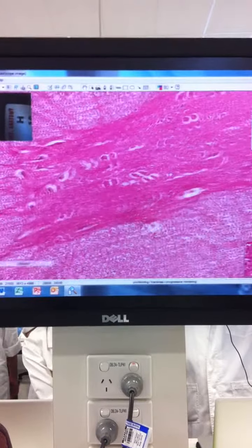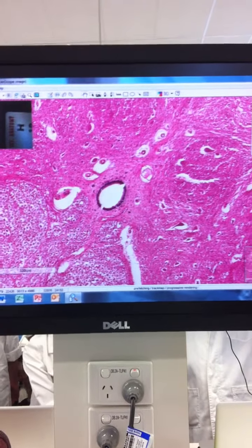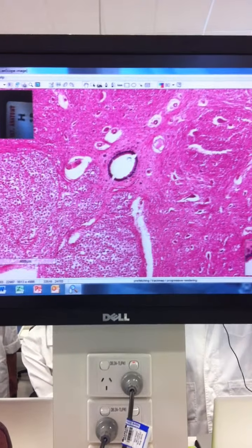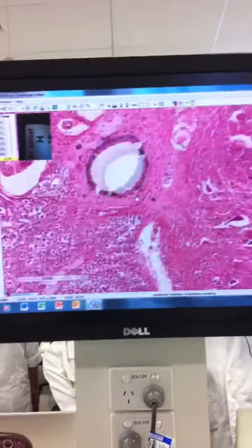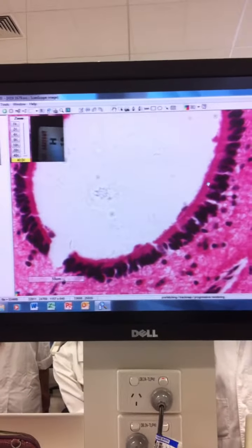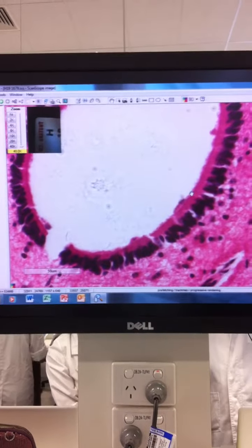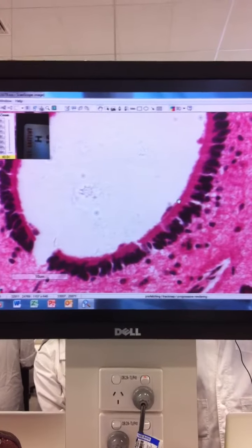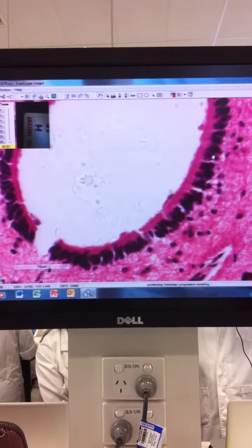The only other thing to really look at when we're in this area then is here, and again it's leaned on its side a bit, so allow for that. But we've got this central canal. And the central canal is a fluid-filled space lined by ependymal cells. You've only got to be able to go so far, but you've got this cilia here. If you look at the magnifying glass down the bottom right-hand corner, it's ciliated, and that's what enables the flow of fluid. And then the columnar ependymal cells that line all fluid-filled spaces in the brain.